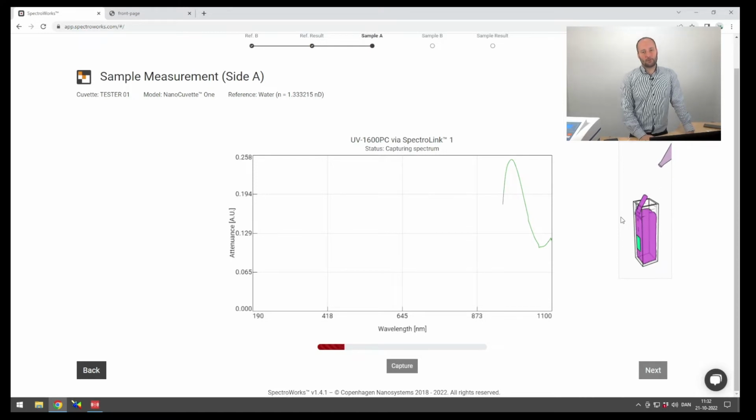It's a little bit more difficult to read the box code on the cuvette because the text is a little bit smaller and it's engraved on a transparent background. So it's not easily readable, but it is there if something is not really working.